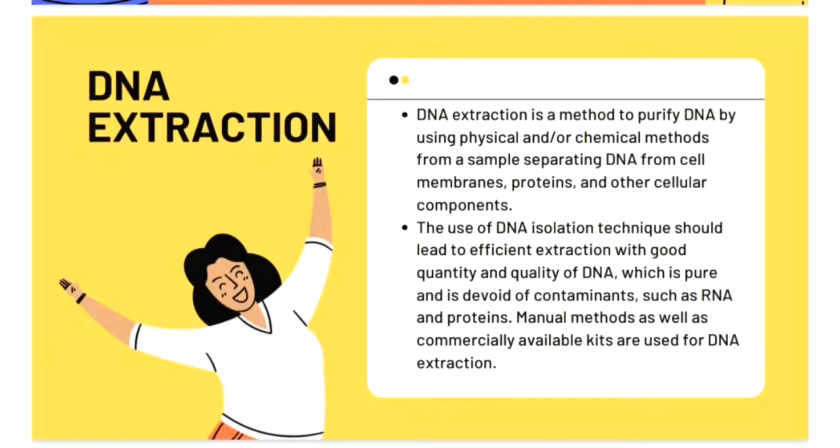DNA extraction is a method to purify DNA by using physical and/or chemical methods from a sample, separating DNA from cell membranes, protein, and other cellular components. The use of DNA isolation techniques should lead to efficient extraction with good quantity and quality of DNA, which is pure and devoid of contaminants such as RNA and protein.